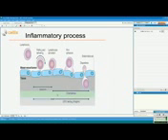And now we go into the application of Cellix's biochips in blood vessels and endothelial cells lining the capillary walls. This is a multi-step process where the leukocyte switches from free-flowing into a rolling state. This is where selectin molecules are involved. Following the leukocyte rolling, the leukocyte activates.